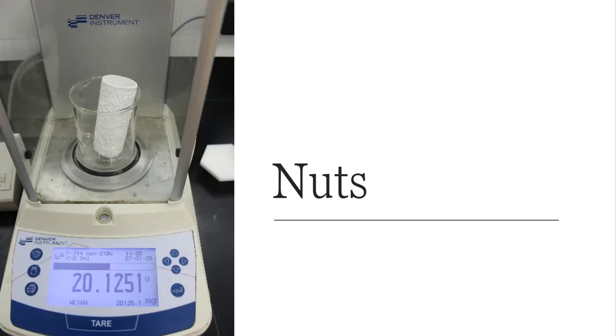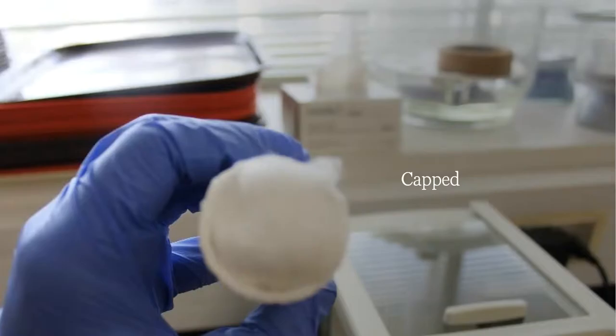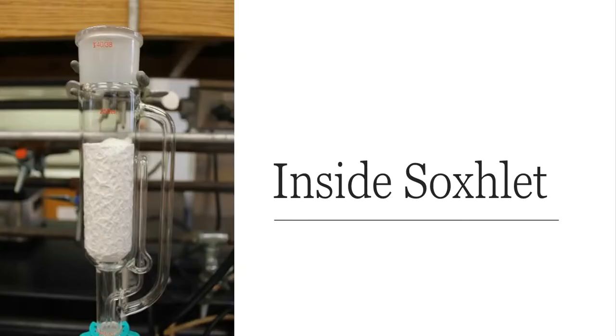So I began to stop here. I stopped there. And then I picked up the thimble. I took a picture from the top view so you can see what those nuts look like on the inside of that thimble. And then I placed my little cotton cap on top of it. Nice and tidy. Keep it clean. And then that thimble with the cotton and the nuts went inside of the Soxhlet extractor.